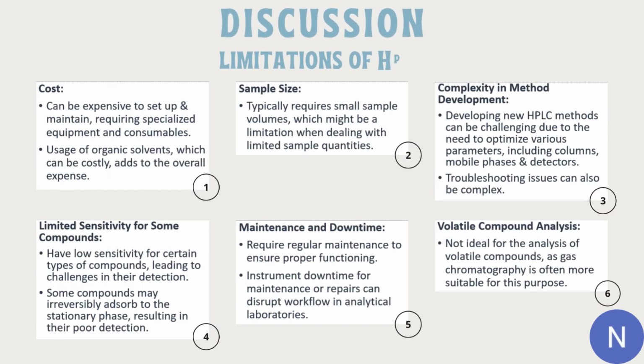Moving on to the limitations of HPLC. HPLC can be expensive to set up and maintain, requiring specialized equipment and consumables. The use of organic solvents, which can be costly, adds to the overall expense. Next, sample size. HPLC typically requires small sample volumes, which might be a limitation when dealing with limited sample quantities.